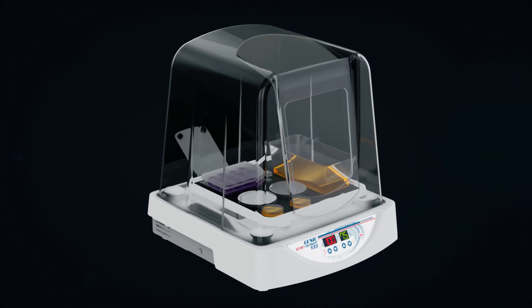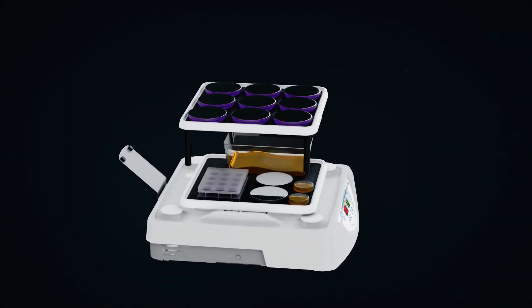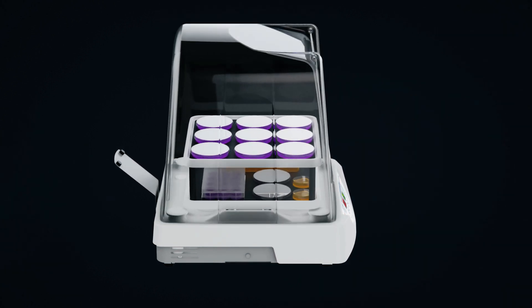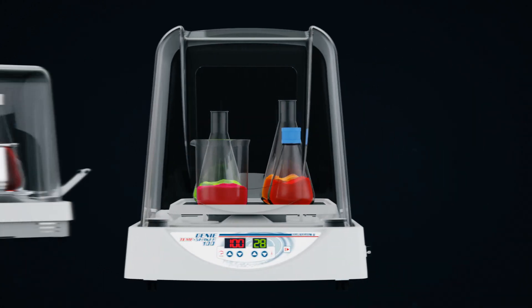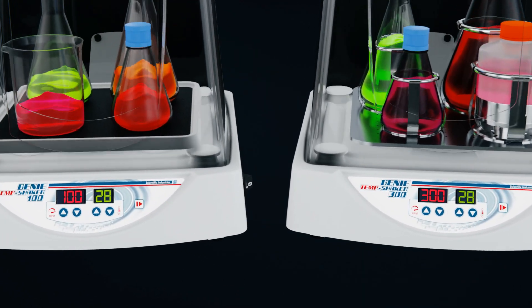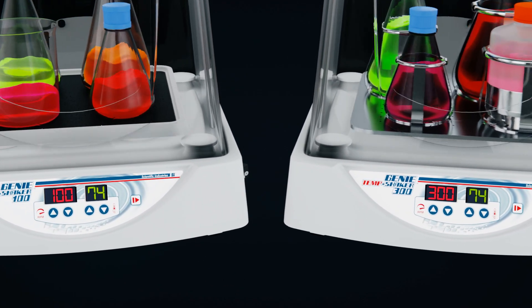Because we know capacity is important, we've designed a stacking tray to make sure all your samples seamlessly fit into the chamber. The GTS 100 and GTS 300 allow accurate temperature control between 28 and 75 degrees Celsius.